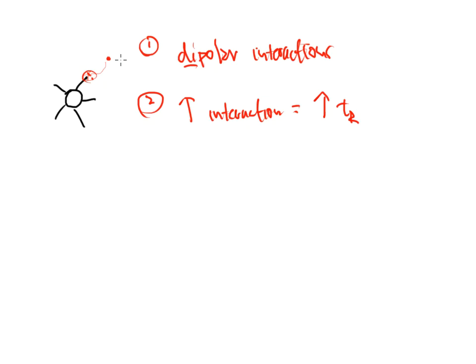They're going to be there a little bit longer. They have no hurry of ever getting out, and you're just going to have to coax them a little bit more and more and more with extra mobile phase in order to push them along and go on out the door so they can go on back to where they came from, right? They can go on back to their own house.